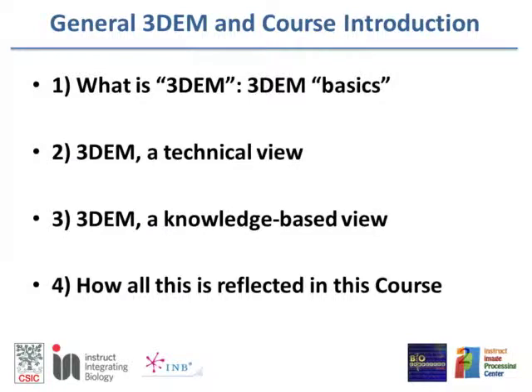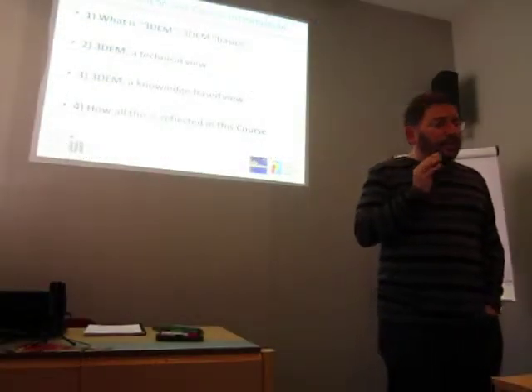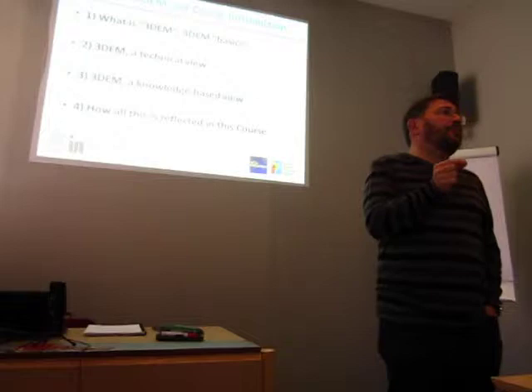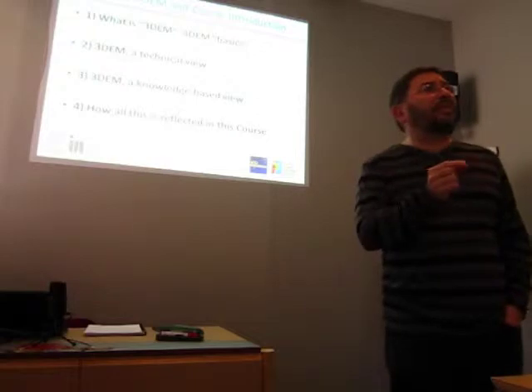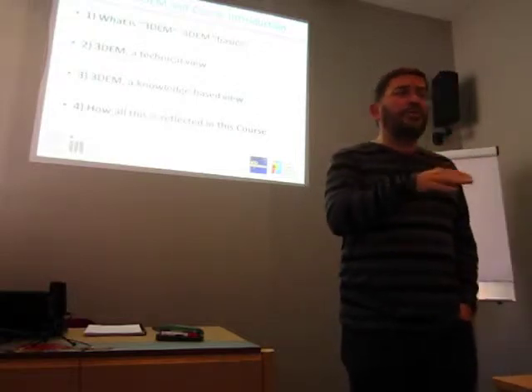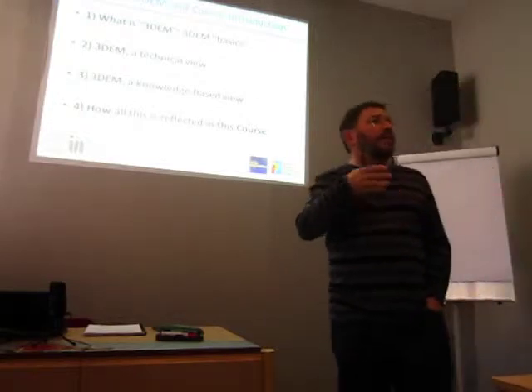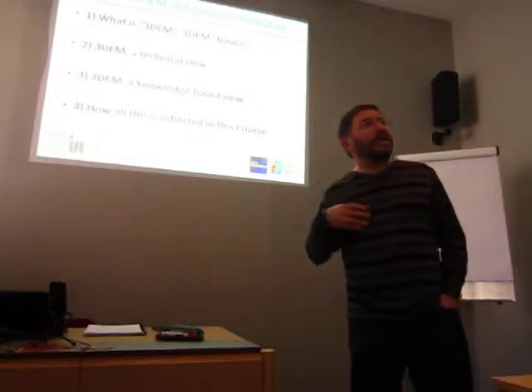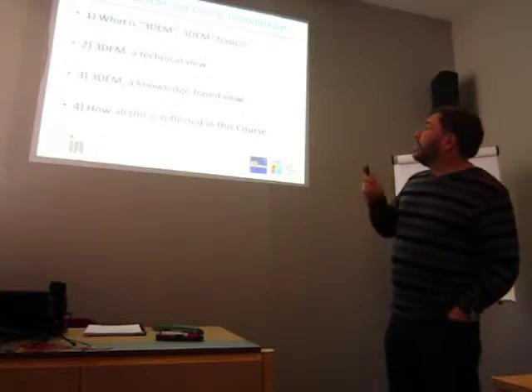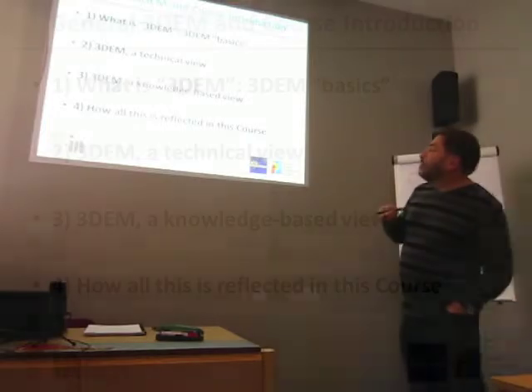Let me introduce what I'm going to talk about in the first lecture. I'm going to talk about some of the basics of 3DEM, and I will make connections to the other people who will take these basics into the details. At the beginning you are going to have some lectures, and at the end of the day you are going to have your computers. We have a cluster, everything is implemented in software and set up nicely in the cluster so that you can access it, and you will do a lot of hands-on work with images there.